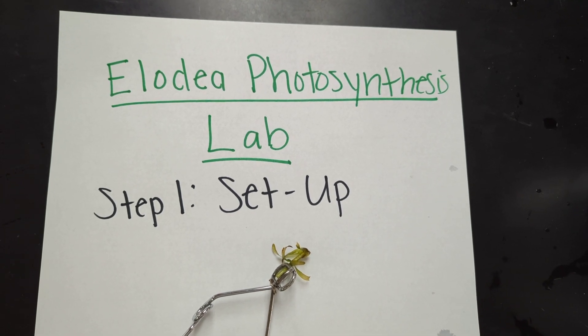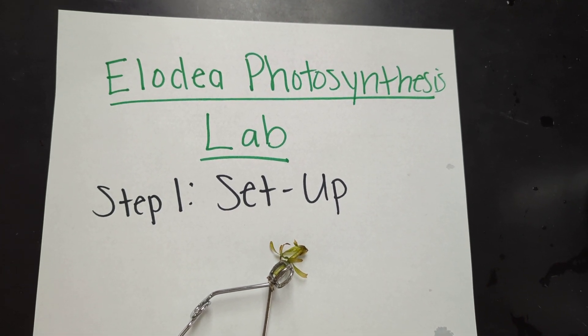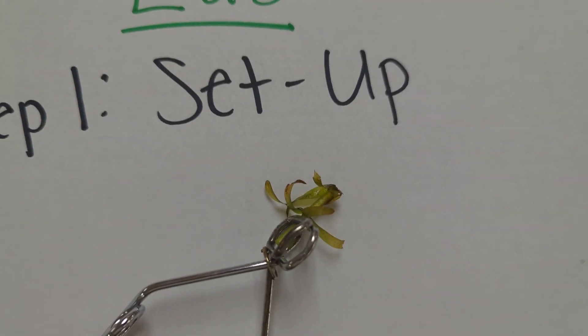This is the Elodea photosynthesis lab setup. Here is the Elodea.